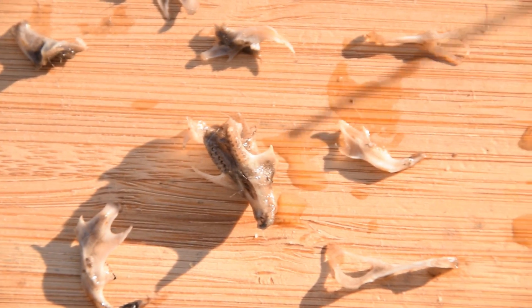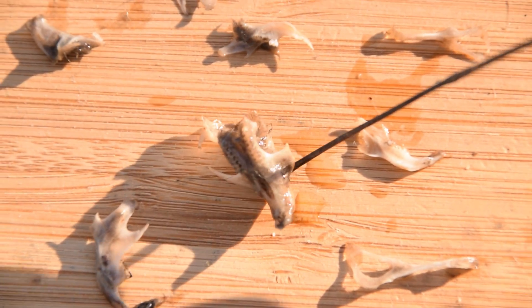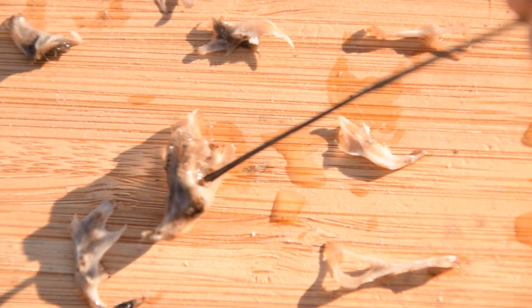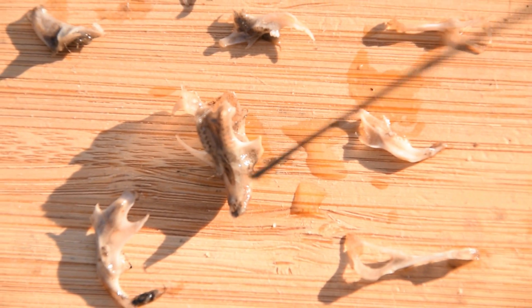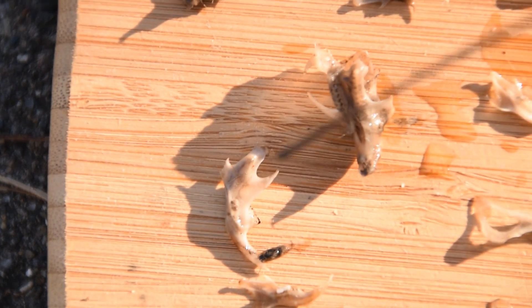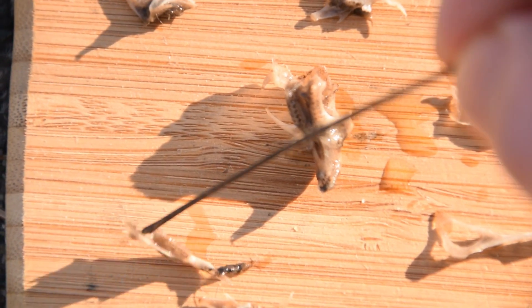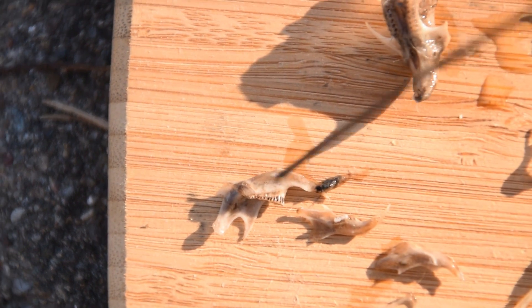Right here is the skull of a very small bird. I can tell this because it does have a beak — or what's left of its beak — right there. We also have the jaws of another creature right here, and you can see the teeth of whatever creature this was. Really cool to see.